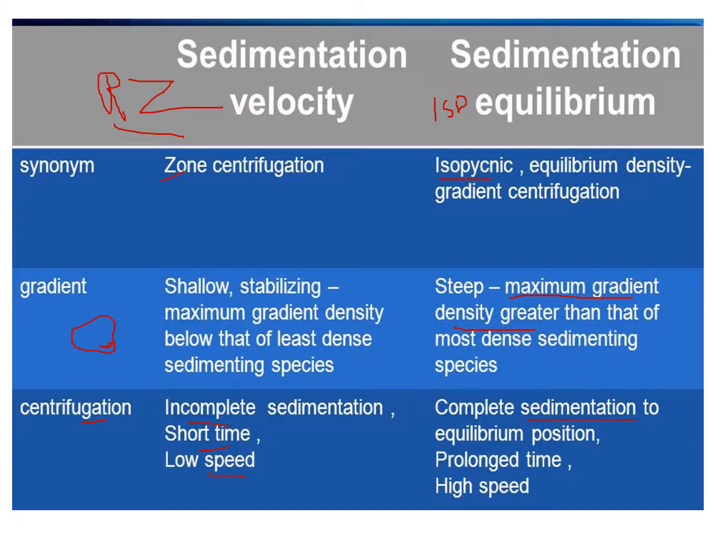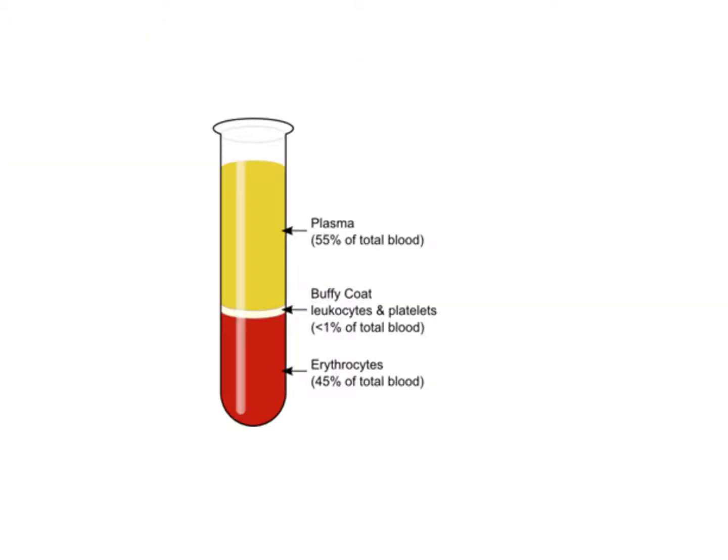This is sediment to their equilibrium position because we have such a steep gradient. Very long time, very high speed. Okay. This one, of course, you can do quicker. This is for organelles. This is more for protein work, and we'll talk about protein fractionation here.